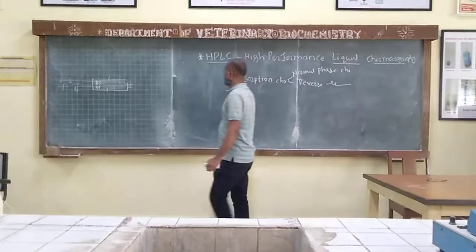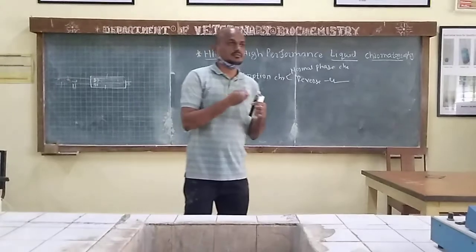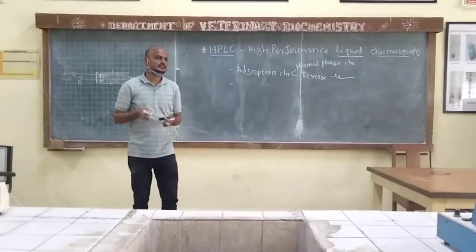Reverse phase chromatography. Next, this is one criteria, right? Hydrophilicity, hydrophobicity. Can there be affinity criteria?